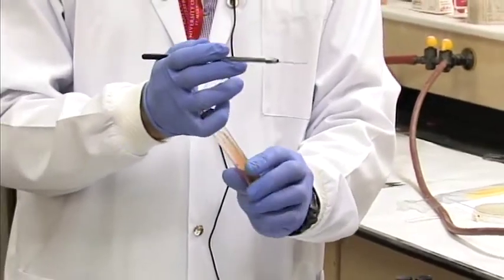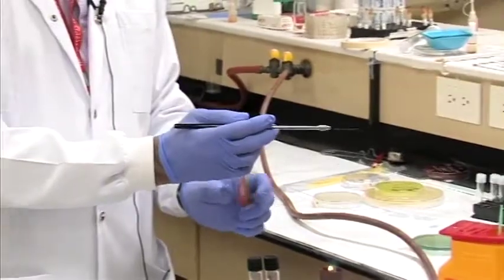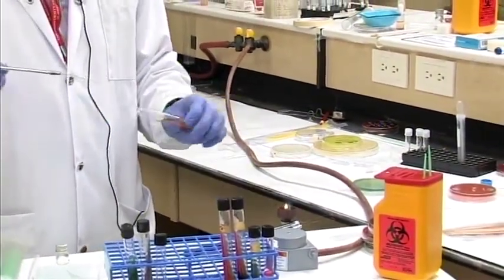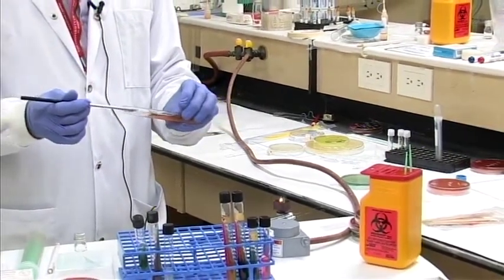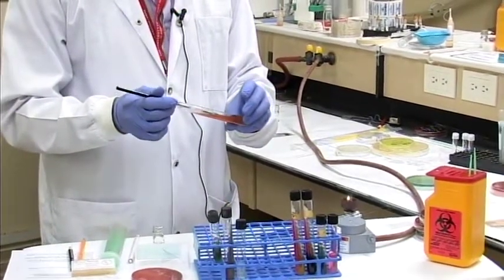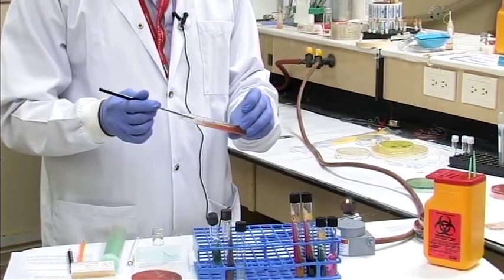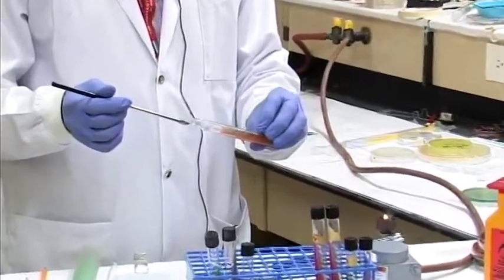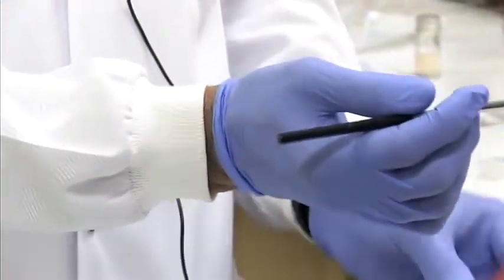Again, use standardized technique for handling your tubes, what they call aseptic technique. Open the cap with your little finger, flame the top, and then go straight in, keeping your hand steady. At the beginning, your hand may shake, but that's okay. We're going to inoculate the tube all the way down the center, and then when we withdraw, we're going to streak across the slant of the tube. This technique for the TSI is called a stab and a streak.